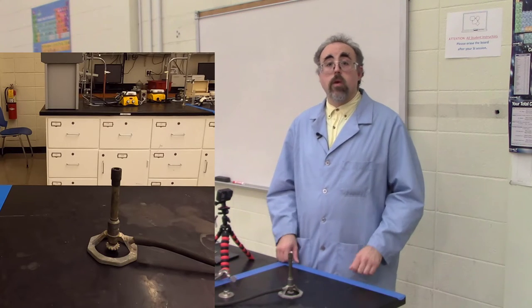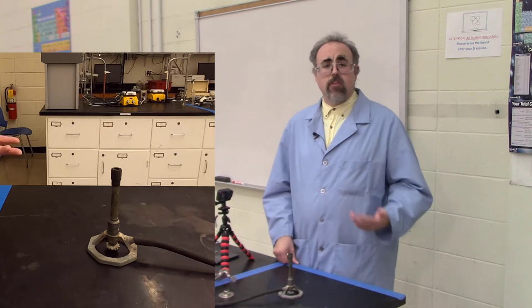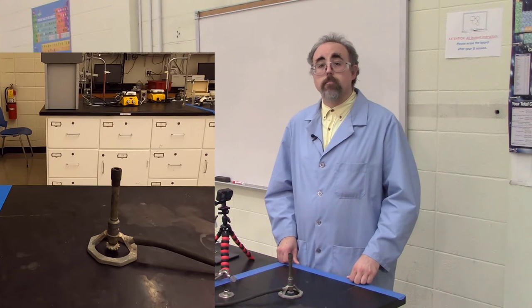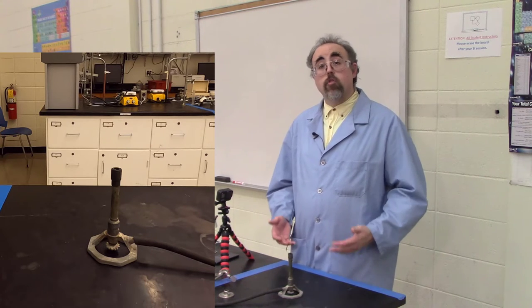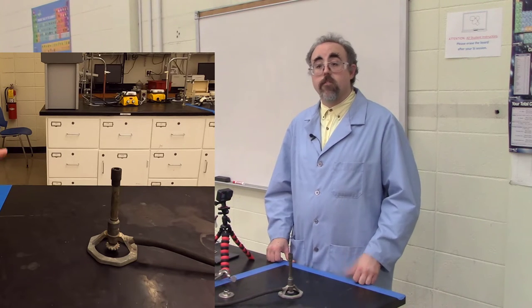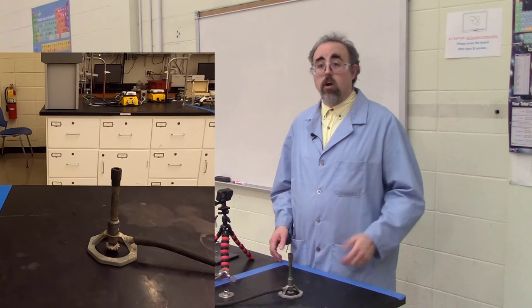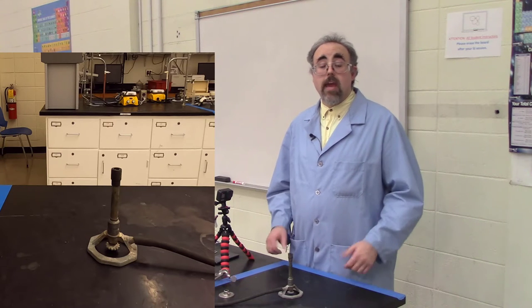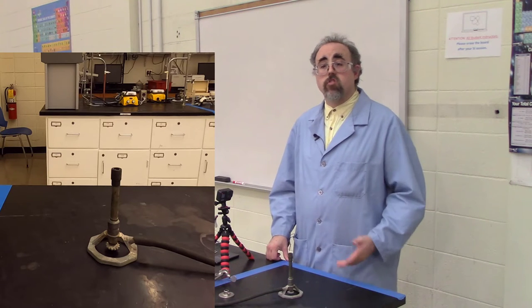Now, speaking of the Bunsen burner, let's talk about a few brief features. On your table will be the gas outlet, or potentially on the wall, depending on your configuration. The gas outlet should be considered your coarse adjustment. Typically speaking, I only use the gas outlet for two settings, off and on full. That said, you can do fine adjustment with those. I just don't recommend it.